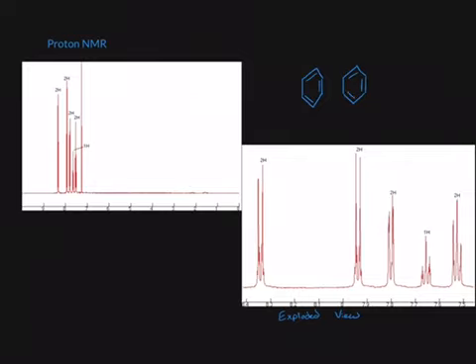So now we've used up 12 carbons, we have 2 rings, and we have alkenes, trienes. So now let's try and find our 13th carbon. That gives us good symmetry here. We've used up all of our carbons, and we will go ahead and use one of the oxygens, which satisfies our carbonyl group as well.